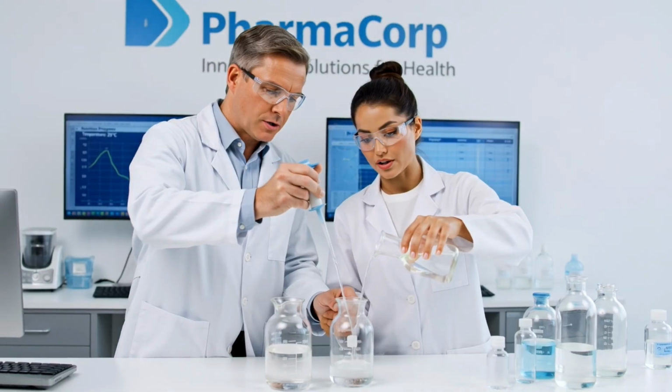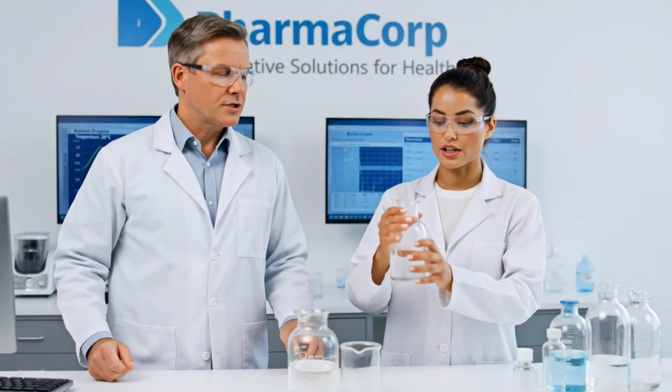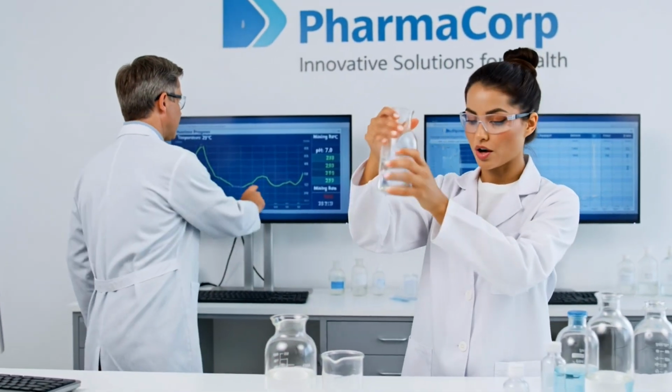Initiating the transfer. Watch the temperature. Transfer complete, the pH is stabilizing. Good. Check the screen for reaction metrics. Confirmed, all within parameters.